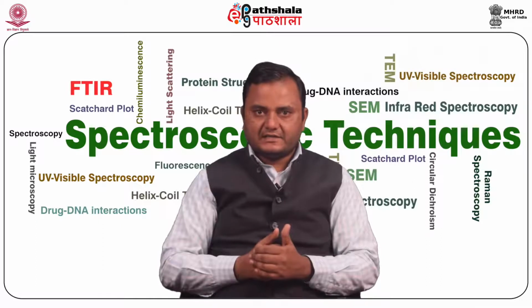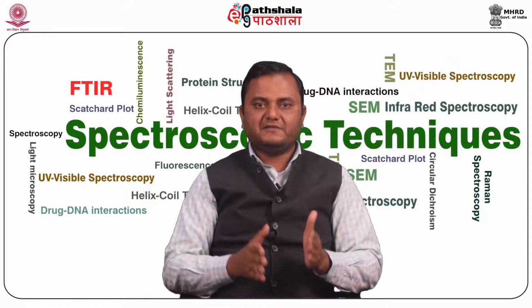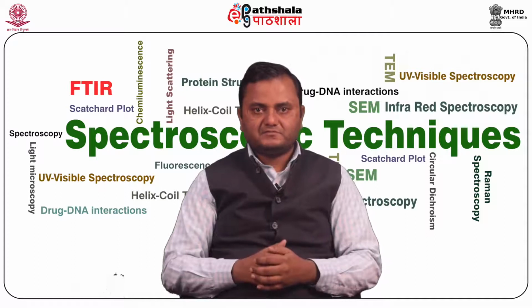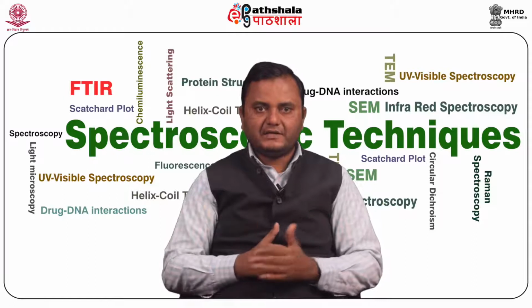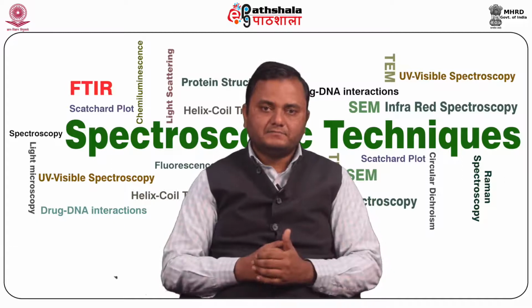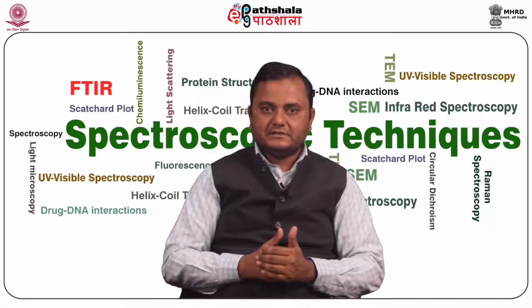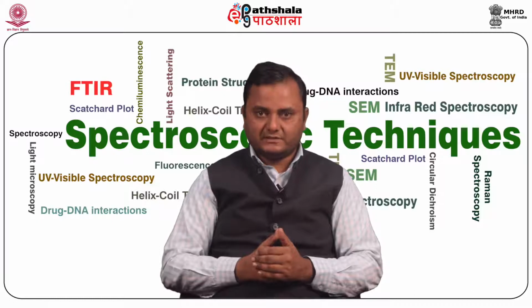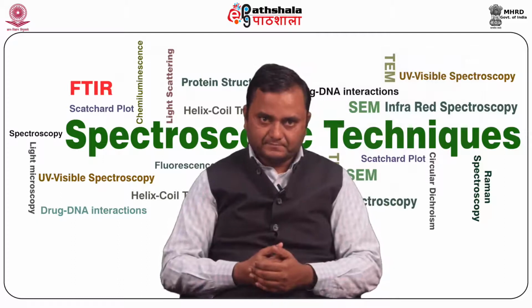And thus the FTIR spectrometer obtains an IR spectrum by first collecting an interferogram of a sample signal using an interferometer, then performing a Fourier transform on the interferogram to obtain the spectrum. An interferometer is an instrument that uses the technique of superimposing or interfering two or more waves to detect differences between them.